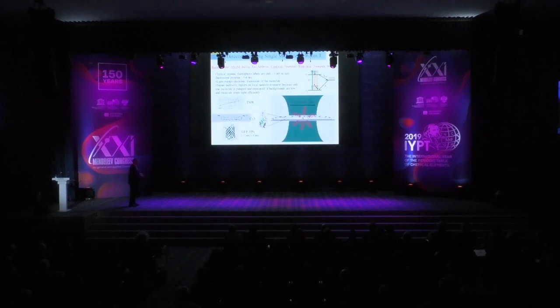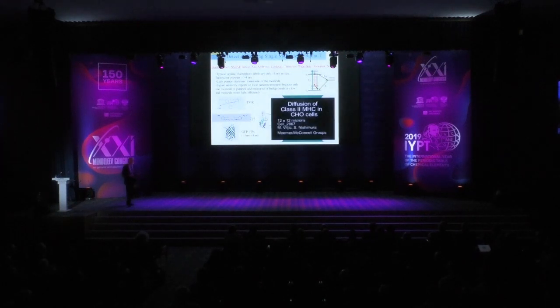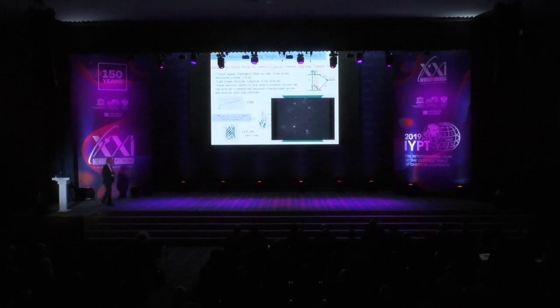And let's look at it again, because this little movie, which is some kind of old, it's still really beautiful to me, because not only do you see the motion, you also see some of the molecules disappear. What does that mean? You notice in one step they disappear. That's a proof that it's a single molecule, but this is photobleaching, okay, on the single molecule level. You don't see an exponential decay. You see the molecule simply disappear, and that's some proof that it is an individual molecule. So there's other things in that movie, but because of time, I'll just keep going.